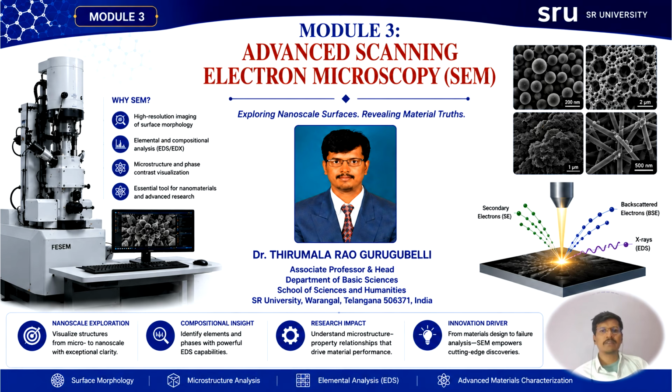SEM overcomes this limitation by using a focused beam of electrons instead of visible light. Since electrons possess much shorter wavelengths than visible light, SEM can produce highly detailed images with exceptional resolution.